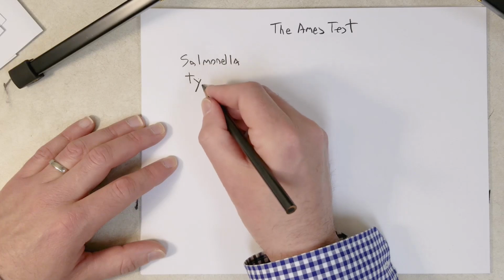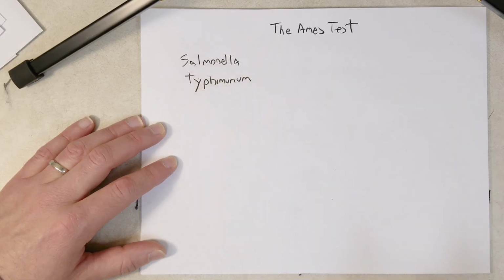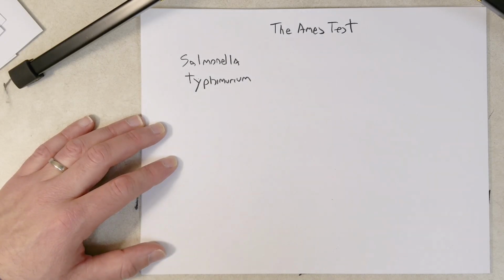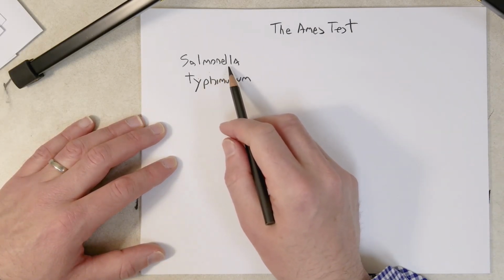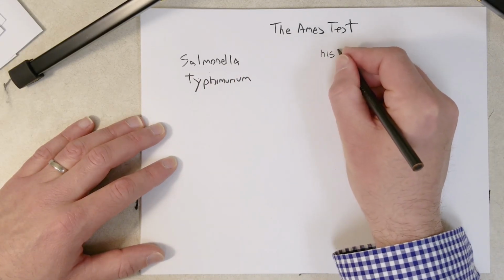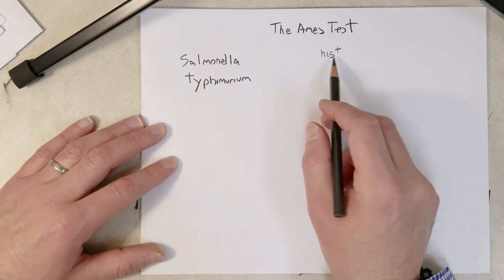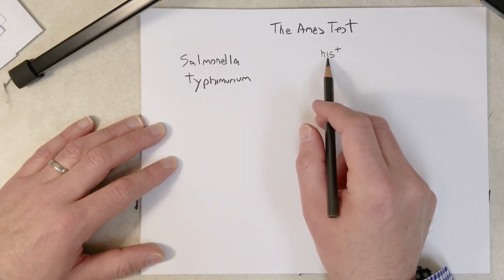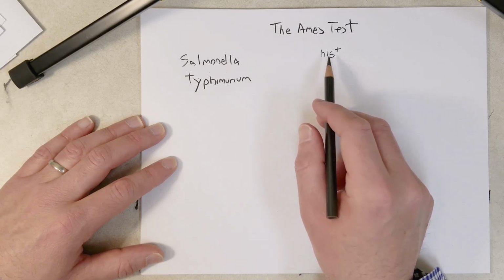Salmonella typhimurium. Haven't heard of that one before. But okay, we're using strains of Salmonella in this test, and we're going to use one or a couple of different strains in particular. So let's say this is the wild type strain right here, and the strain is His plus, so it's just a wild type strain.